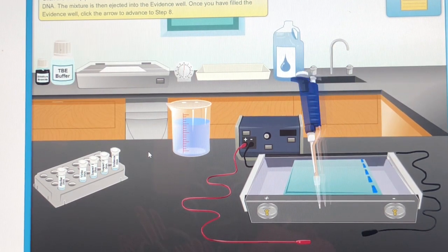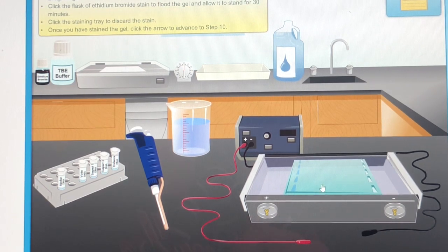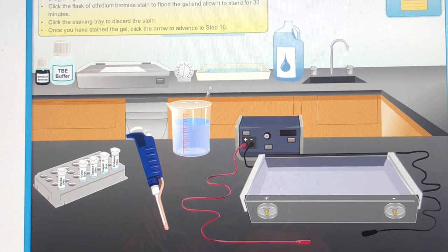Once you have filled the evidence well, click the arrow. Click the power supply to connect the electrodes and produce electric current for one hour. Notice that the negative electrode is closest to the wells and the positive electrode is farthest from the wells. Drag the gel from the electrophoresis chamber to the staining tray. Click the flask of ethidium bromide stain to flood the gel and allow it to stand for 30 minutes. Click the staining tray to discard the stain. Once you have stained the gel, click the arrow to advance to step 10.